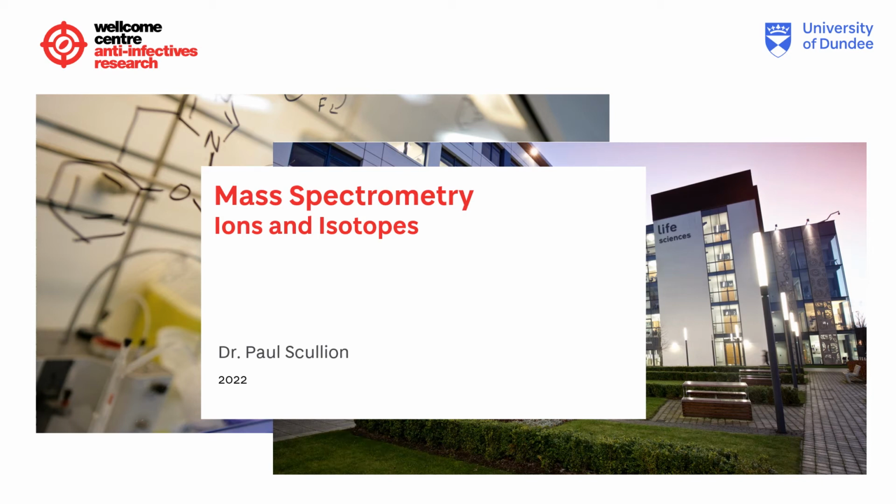In this series of talks, we're going to look at the application of mass spectrometry with particular reference to its use in drug discovery and medicinal chemistry. For this first talk, we will look at the importance of ionization, charge, and isotopes.